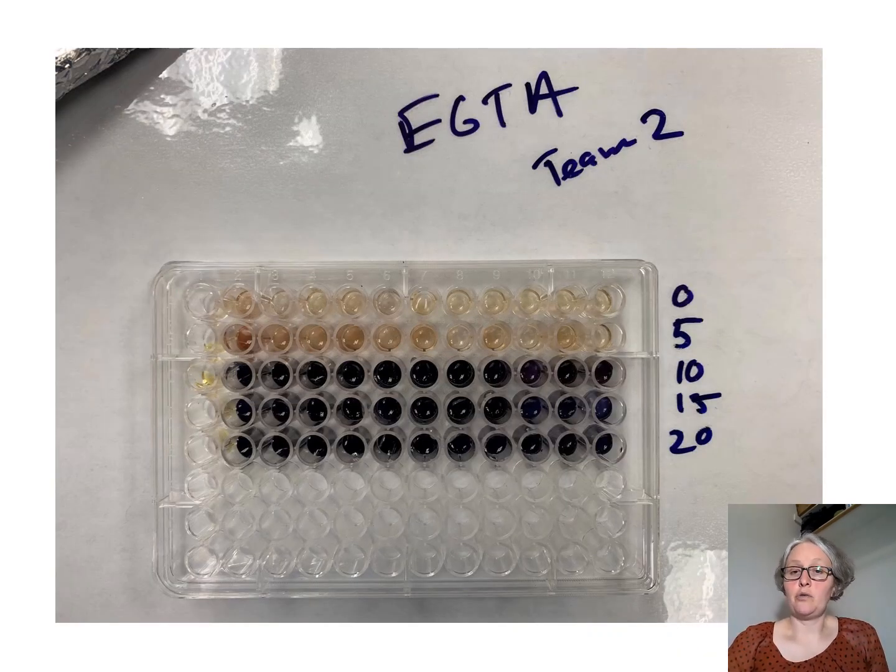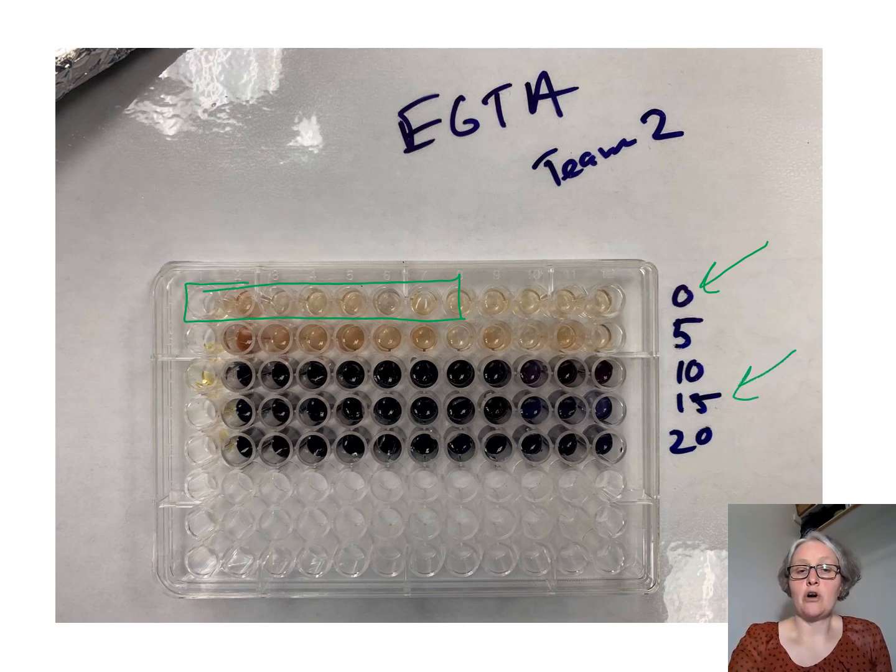Here's what you may have seen. Again, this is slightly different than what you ran. Here's the enzyme running at normal, and you can see, oh, it goes yellow. It's working really great. And then here's what's happening to the enzyme when we start adding EGTA. You can really see at those higher concentrations especially that it just stops working. What do these results indicate? These results indicate that amylase does require a cofactor to function.